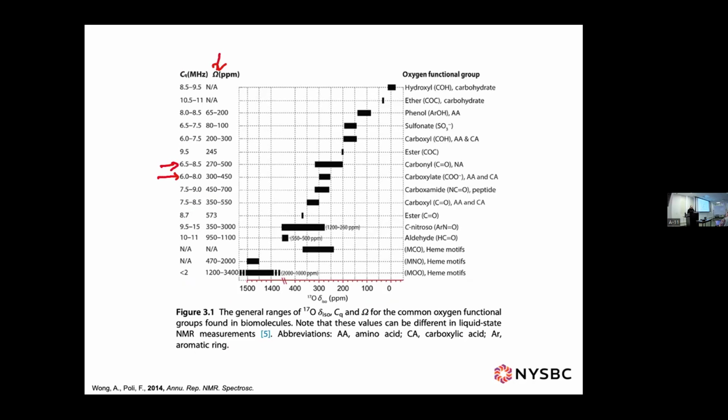This is taken from that review that I took the chemical shift ranges from that I was showing earlier. Some of them, like this group here, have up to 3,000 ppm CSA spans. So your CSA is a major problem as you eliminate your quadrupolar coupling, which can be up to 15 megahertz, by going to, let's say, 40 Tesla, 1700 megahertz. Your CSA is going to be huge, and to spin it out, you'll need to be spinning at 100 kilohertz just to detect the oxygen without massive overlap of the spinning sidebands.